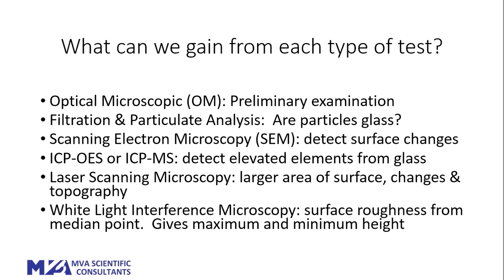Scanning electron microscopy helps us detect surface changes at higher magnification — we can see signs of pitting, delamination, or areas where the glass surface has been removed. In worst-case scenarios, you can actually see areas that look like an open clamshell where part is still attached to the glass surface and part is lifting away — not yet delaminated but on its way. That would represent one of the worst-case situations.